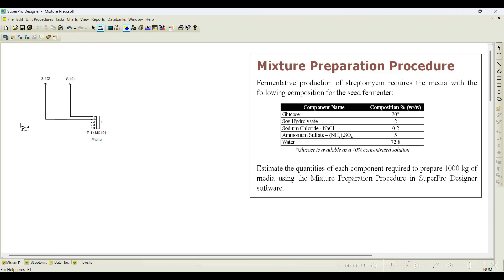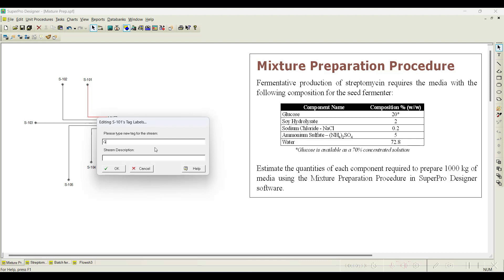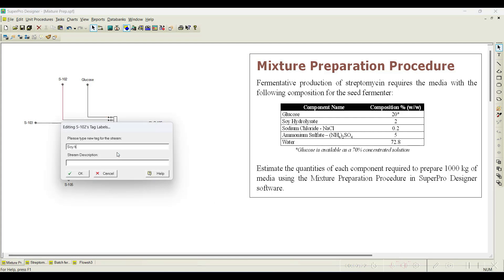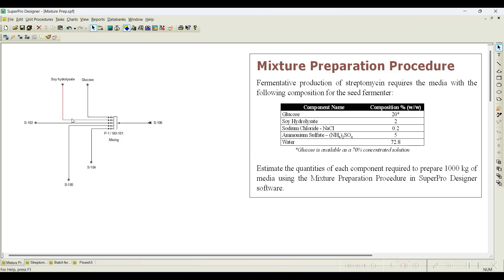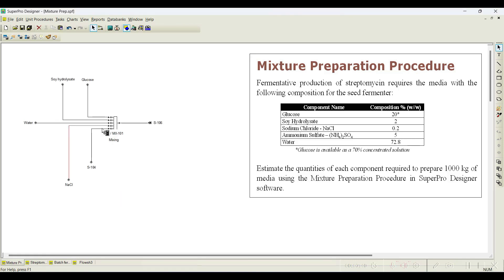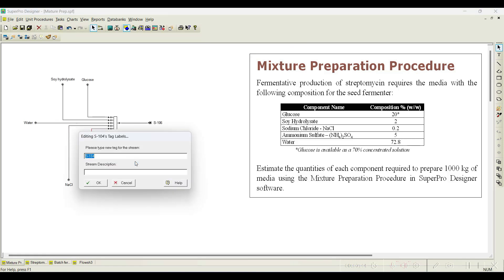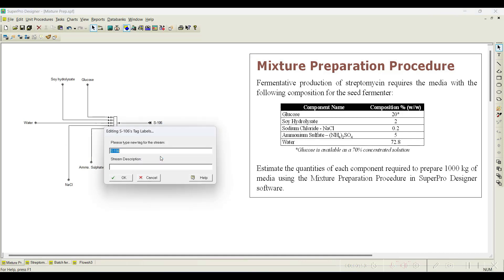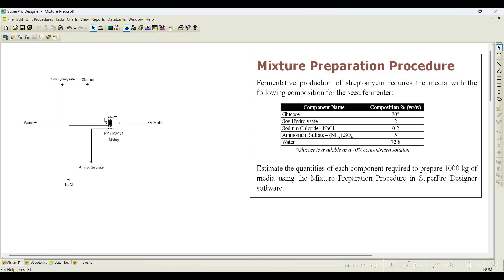Add the first stream, then add the second, third, fourth, and fifth streams, and also one output stream. Let us rename these streams — this one as 'Glucose', this one as 'Soya Hydrolysate', and this one as 'Water'. Now let us initiate the streams.